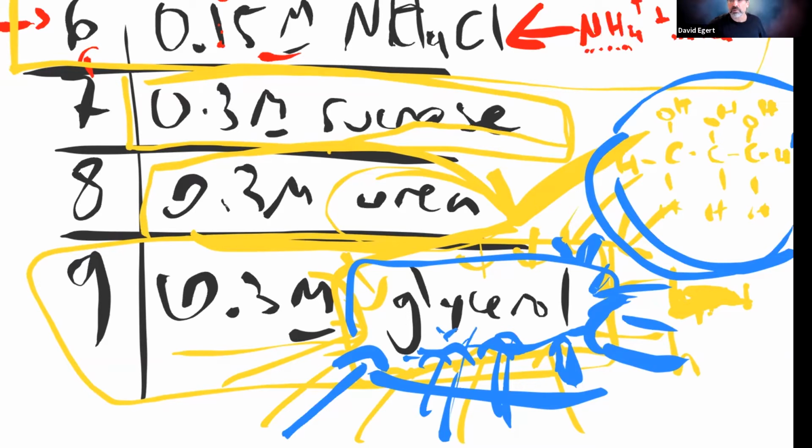It's probably hypotonic if you wait long enough. I'm hoping most people have written up their hypothesis. Just leave your hypothesis as it is, and then in your discussion, you can discuss what we actually see.